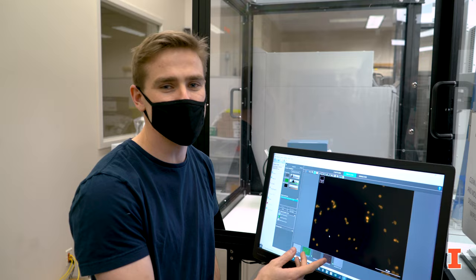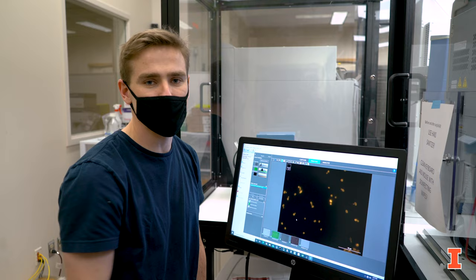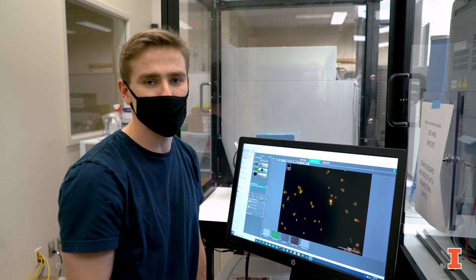Here in this image we've stained the mitochondria in Saccharomyces cerevisiae with a stain called MitoTracker Orange — that's why you see the orange color. Right here you can see one of the buds coming off, the daughter cell coming off the parent cell. Basically what we're trying to do is track localization sequences to the mitochondria.